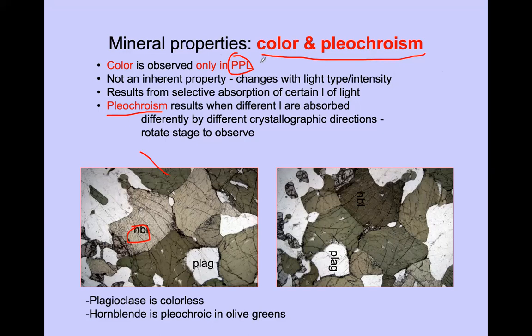So what happens? You can see one mineral here showing a stronger greenish color than this one. But actually both of these are the same mineral, hornblende. Now you saw two colors here, but I said this is the natural color also, right?